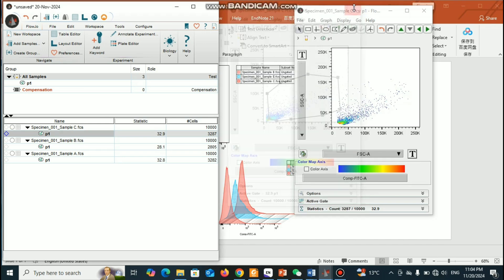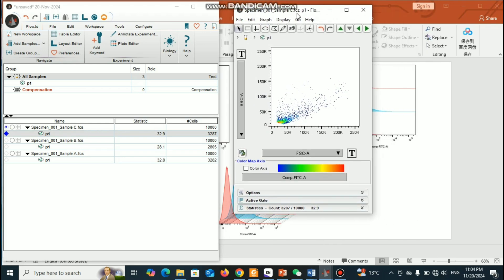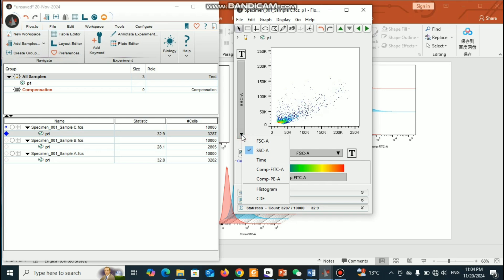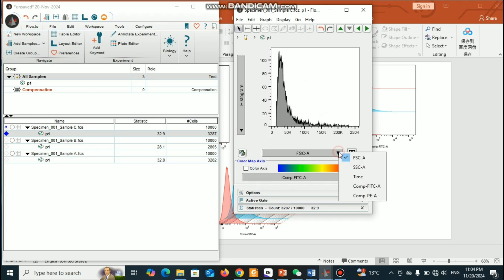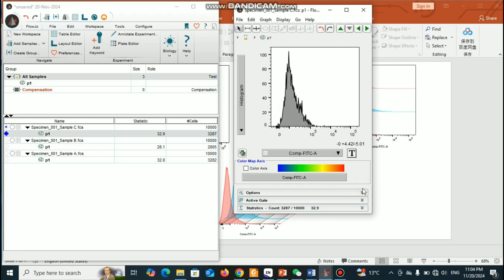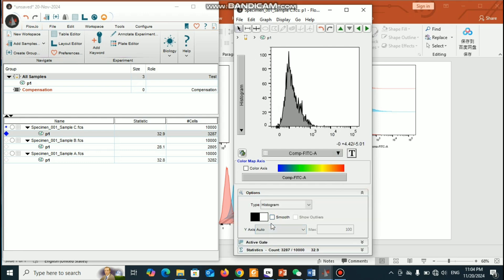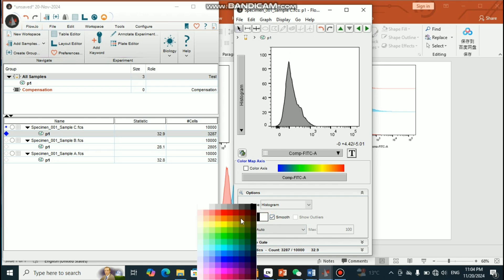Now I can delete this one — I don't need it. I only need this data. Now you can change it to histogram from here, and here you can change the channel to FITC. You can also apply smooth and change the color as well.